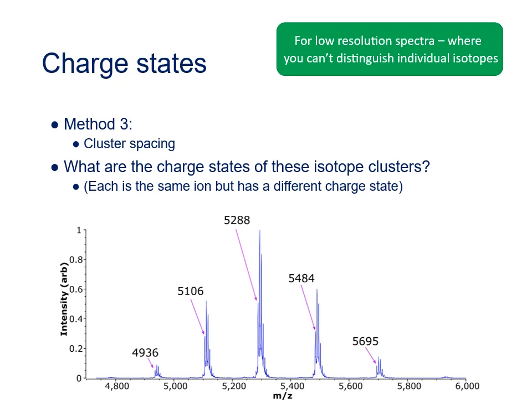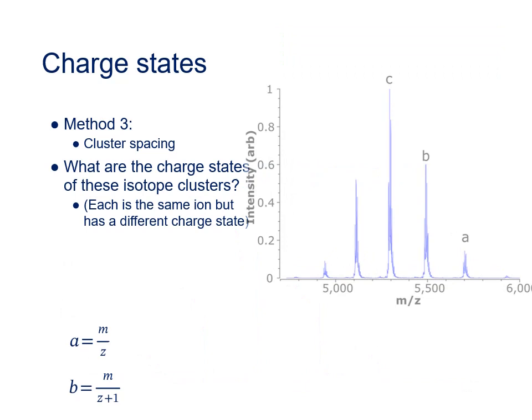Now we've zoomed back out again, we can have a look at the detail of the wider set of peaks. Now although it might look like these peaks are evenly spaced, actually they're not. The mass spacing between clusters at this high mass end is 211, and down at this end it's only 170. So as we get to lower mass, the spacing between the peak clusters gets less and less. And that's because these peaks are actually the result of viewing the same set of ions at ever increasing charge states. And it's because we can see these same ions at different charge states that we can work out what those charge states are.